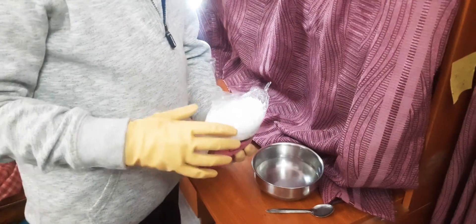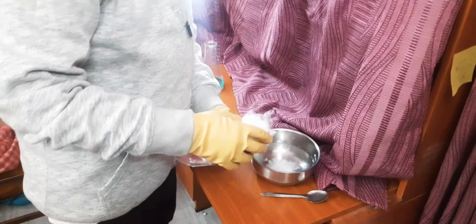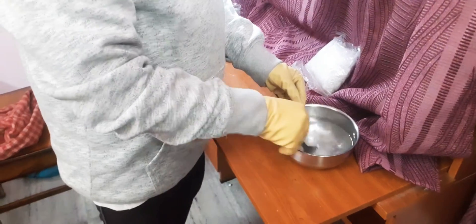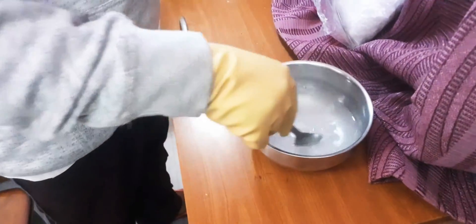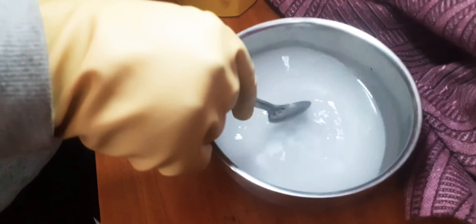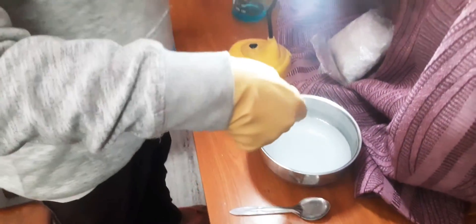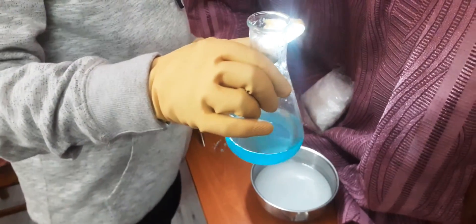We are going to dissolve it in some water. Be careful while handling it because it's quite corrosive — always use a glove while doing this experiment. Here is copper sulfate; it's a nice blue color.